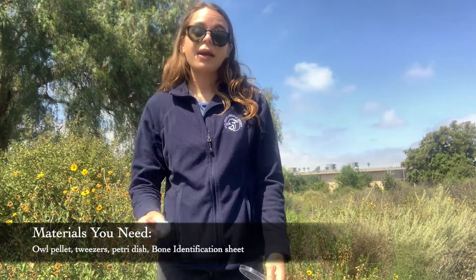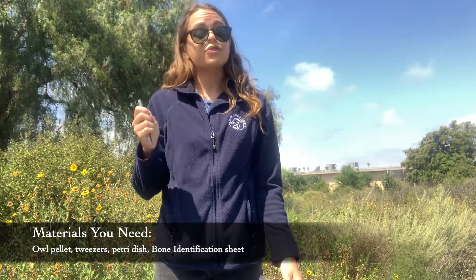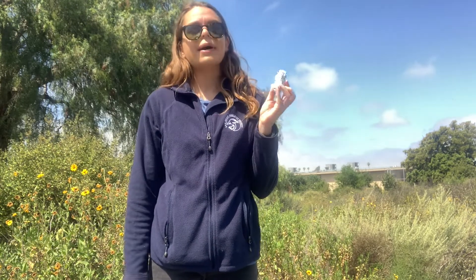For our owl pellet dissection today you won't need too many materials. The most important thing that you'll need is your owl pellet. Beyond that, a pair of tweezers really helps us to pick through the pellet, and it's great to have a petri dish, which is a small tray you can use to sort out the things that you find. I'll be holding my owl pellet up as I go through my dissection today, but it's probably a good idea to be working on a table or a flat surface. It's also great to have a bone identification sheet, which will help you figure out what type of animal your owl has been eating.